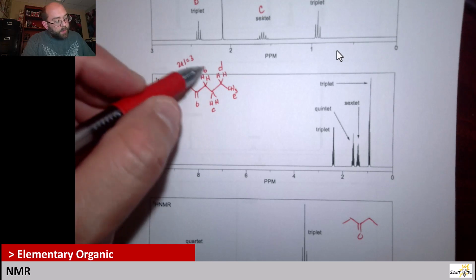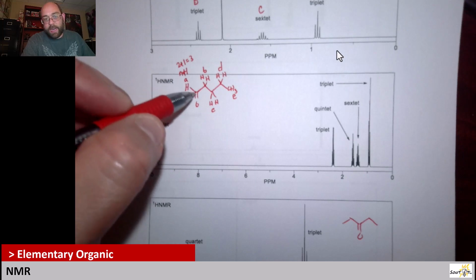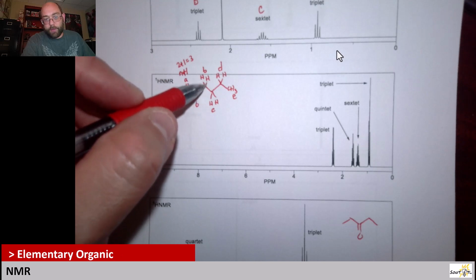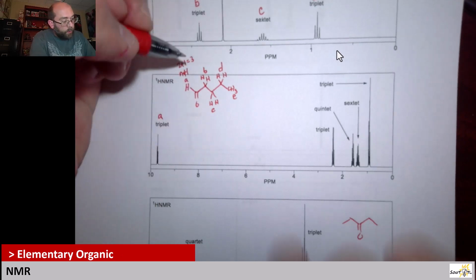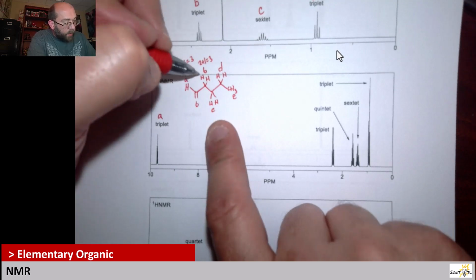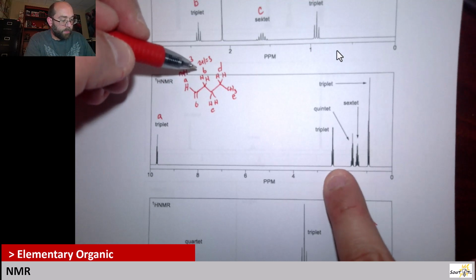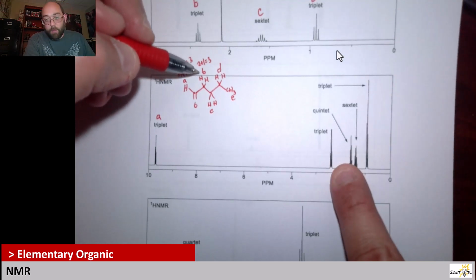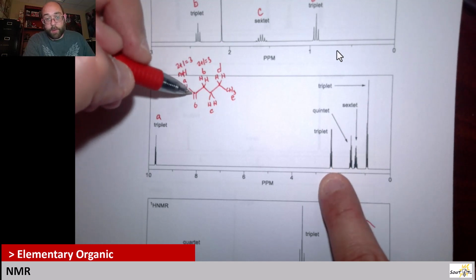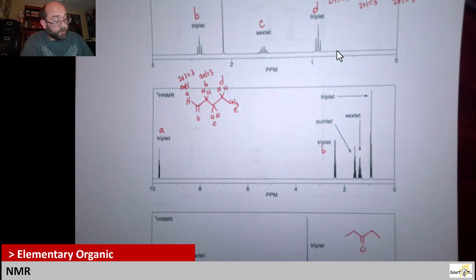The big deal with these B hydrogens is that this aldehyde hydrogen is most likely invisible to them, so this is probably going to give us a triplet, the B hydrogens. It really only sees these 2, so that'll be 2 plus 1 to give us 3. Now we have 2 triplets, but odds are one is more downfield than the other. I'm banking all my money that the most downfield triplet is the hydrogens closest to this carbonyl, this double bonded oxygen. So I'm going to label these as B, because we already saw that in the previous example.